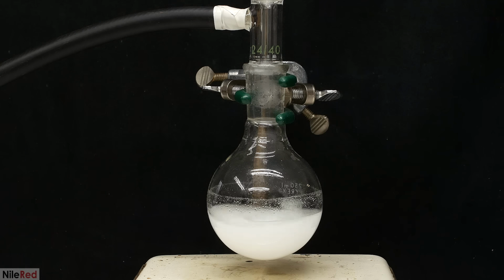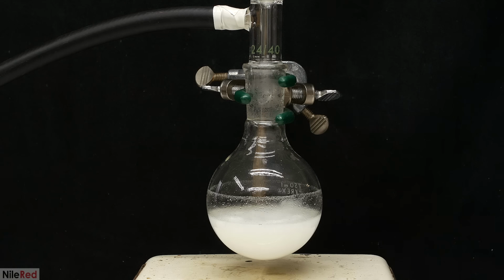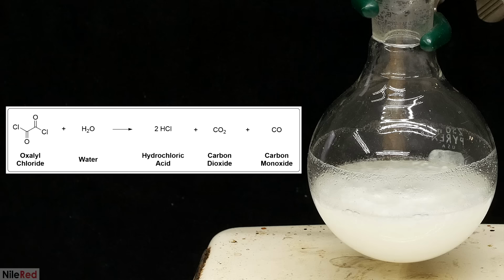I open the addition funnel, and the oxalyl chloride is added over the course of about 5 minutes. My dichloromethane and adipic acid aren't perfectly dry, so there's a little bit of water present. The first little bit of oxalyl chloride that's added is going to react with the water, and it can sometimes be pretty vigorous. It's highly unlikely that it would ever cause it to bubble out of the flask, but it's just a good precaution to take.